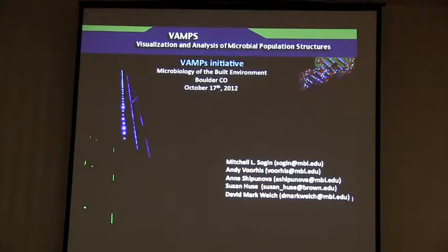Ultimately, because of the efforts that we put in and the fact that we were working with a very large community of microbial oceanographers who wanted to collect similar kinds of data, we decided that we needed to build some kind of easy-to-use website or database that people could use without necessarily being super intelligent about writing Unix scripts or anything else. So in a sense, it was analogous to the Built Microbiome program, where you have architects and building engineers who don't have any reason to have experience with handling molecular data. And so that gave rise to VAMPS.